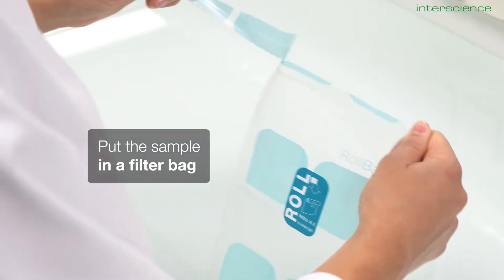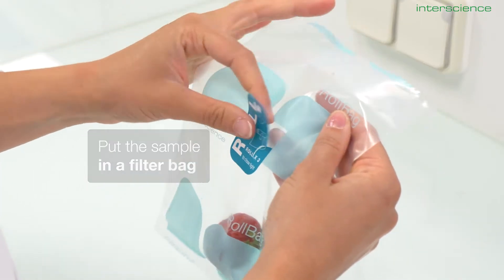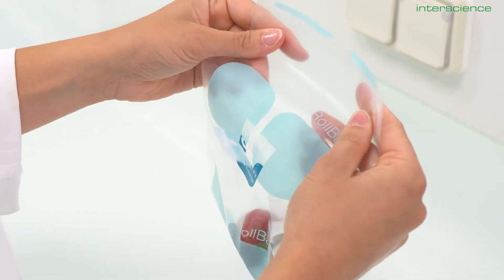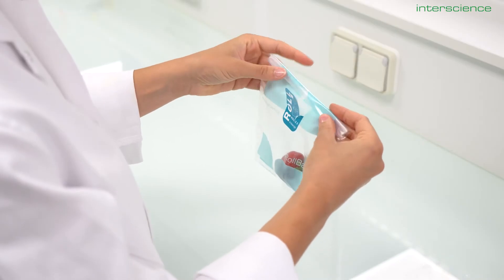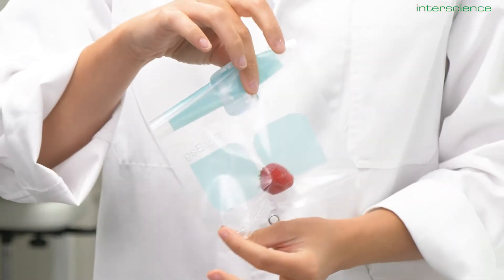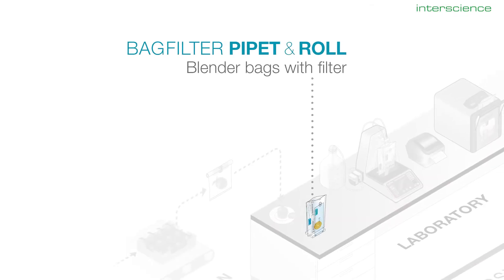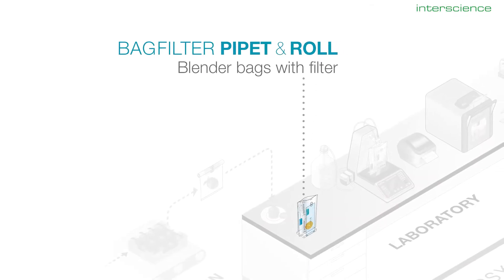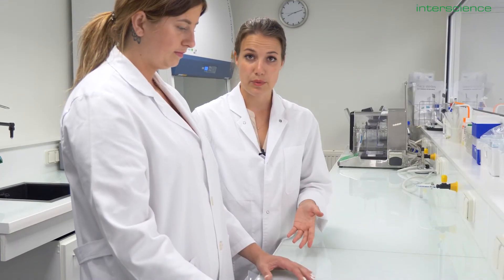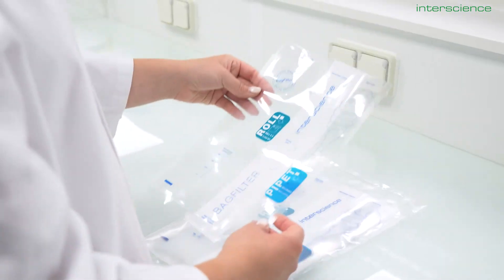Roll bag is a new take on our classic sampling and transport bag. Each bag is gamma irradiated for a contamination-free analysis. We developed a new system with a closing sticker that guarantees water tightness and ease of use while remaining metal-free. If you are working with solid samples, you can start with one of our gamma irradiated bags with an integrated filter.